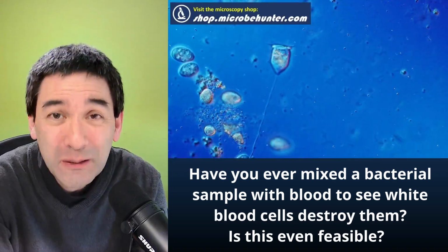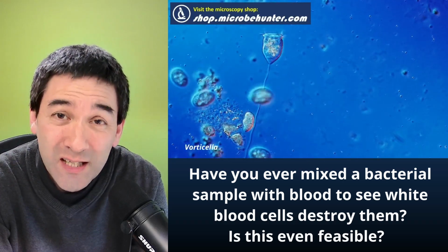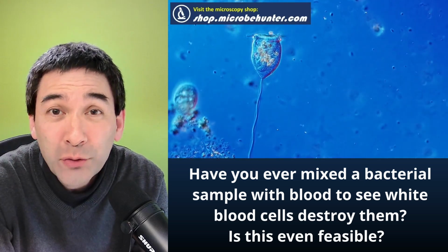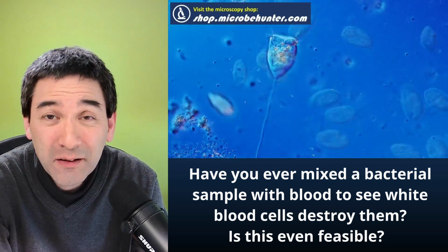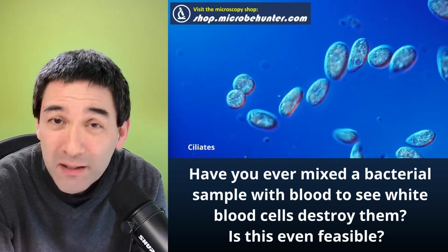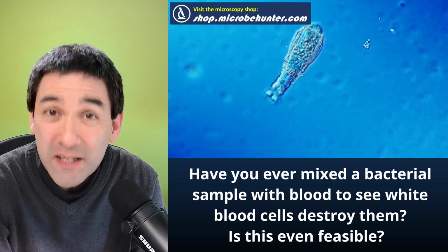Okay, I need to give you a little bit of background information here. One of the videos that I've made, which is actually quite successful, is a video which shows white blood cells, so-called phagocytes, moving around on a microscope slide and searching for bacteria. And it would be now kind of interesting that maybe it's possible, if you were to add some bacteria, to actually see them eat up those bacteria. And indeed, this is something that is possible and is feasible.